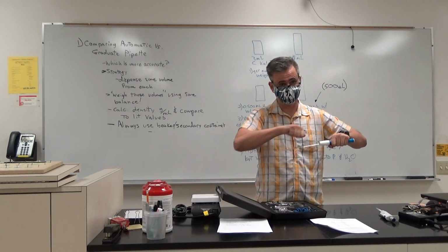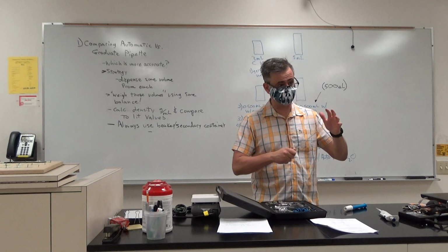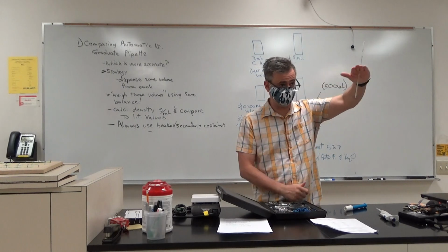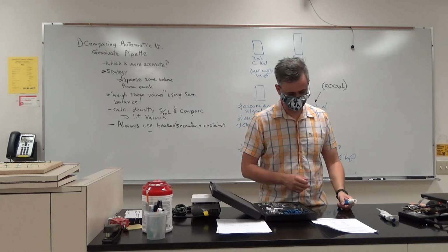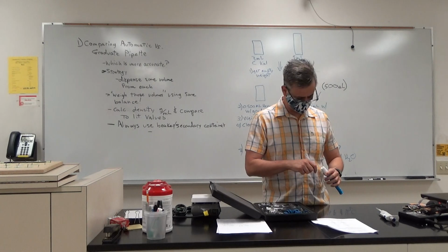Towards the other hand. I've seen 2 people impale themselves through the hand, all the way. Glass comes out the other side, and they go to the hospital. One guy had to have surgery to reconstruct the nerves in his hand. Anyway, that's a place we want to be cautious.